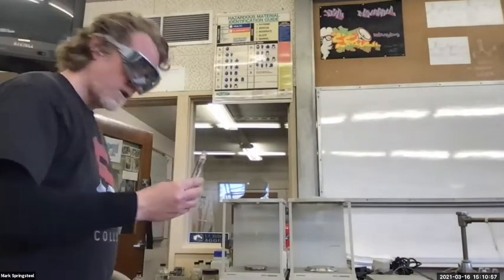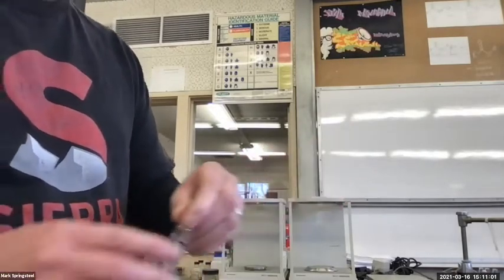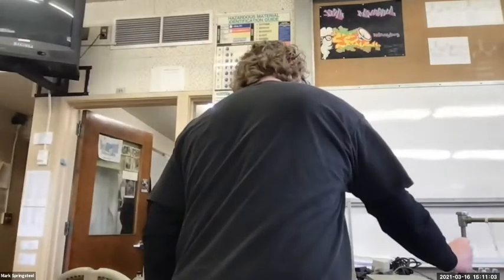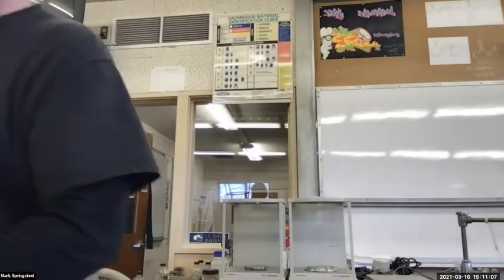All right. So I've got benzocaine and benzil in here. And now I've made a mixture of the two. I want to separate them. How am I going to separate them? With extraction lab techniques. And you guys are going to tell me how to do it.